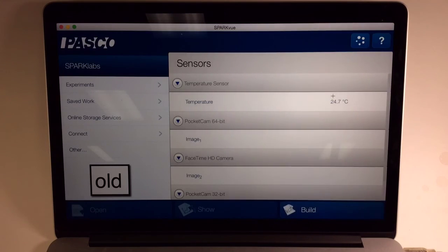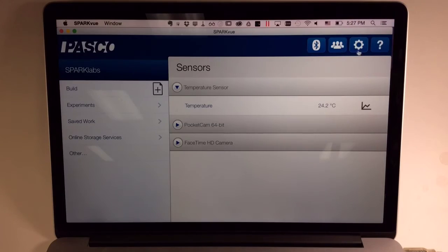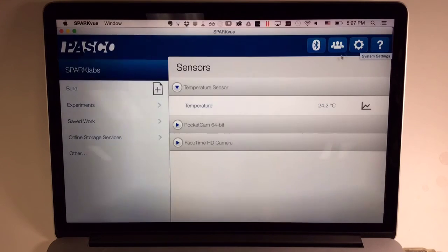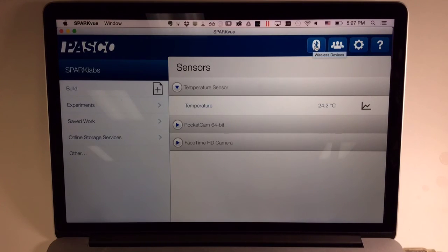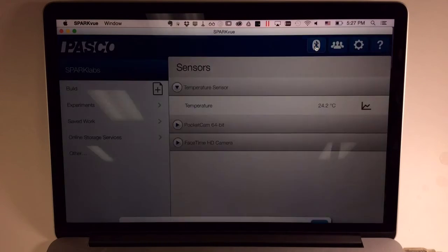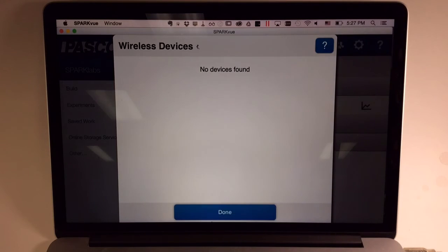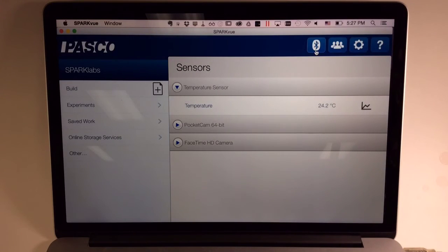The old Settings icon has been changed to a more traditional Settings gear icon. And the Connect to a Bluetooth or wireless device screen has been promoted to have its own button here.